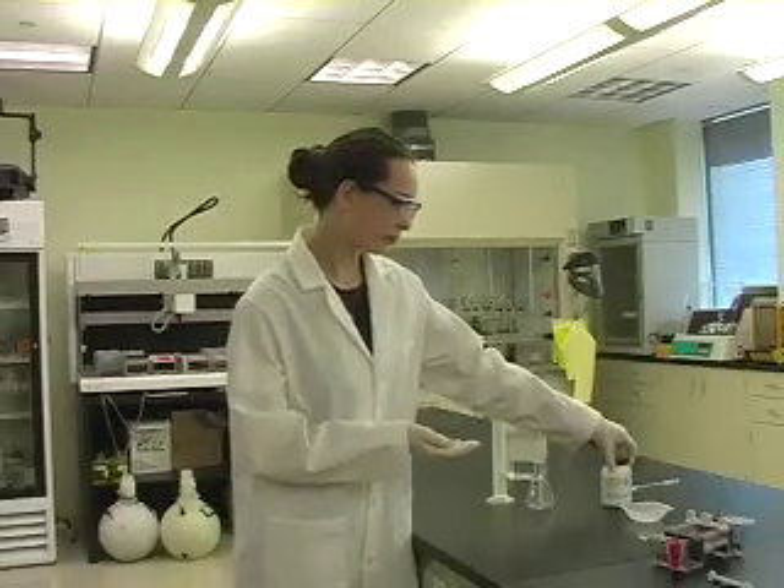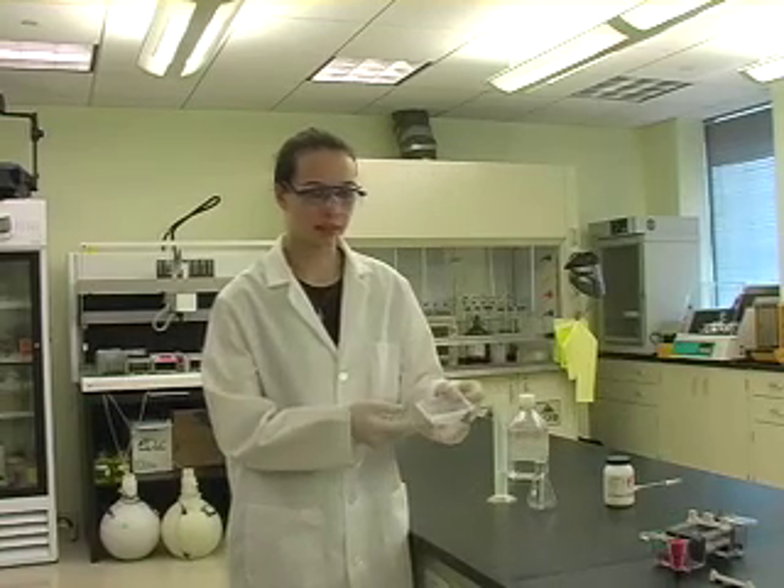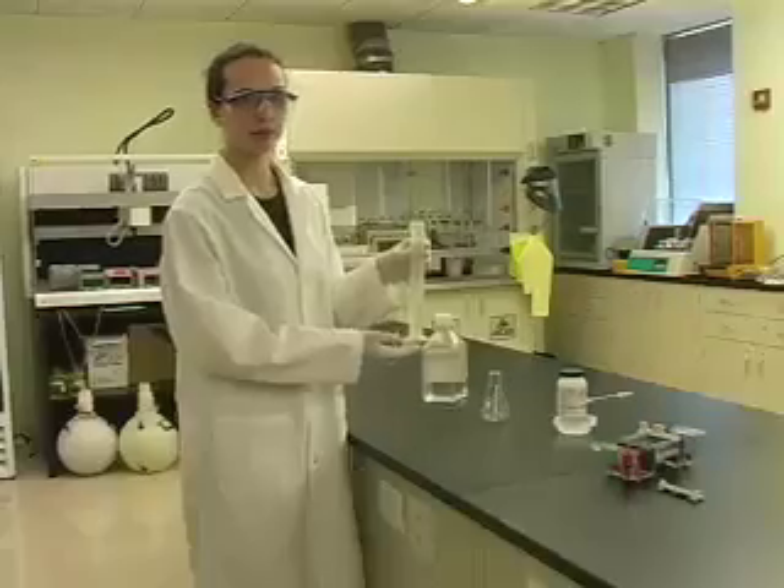An agarose gel is made from pure agarose, a white solid, and a buffer — usually Tris-borate EDTA, a clear liquid.